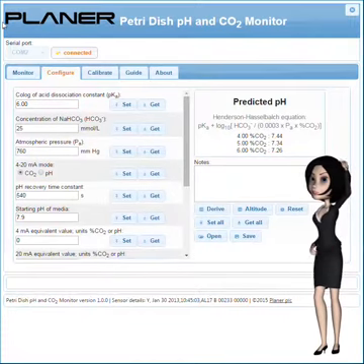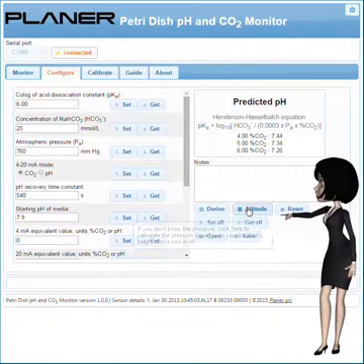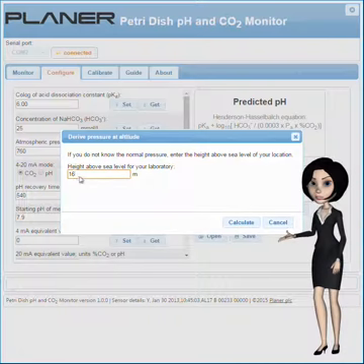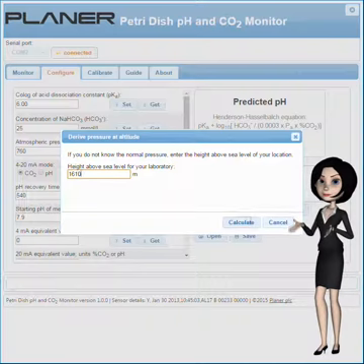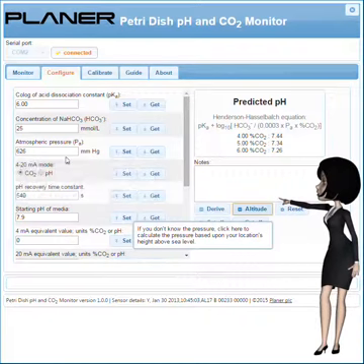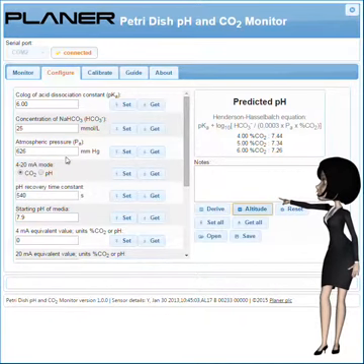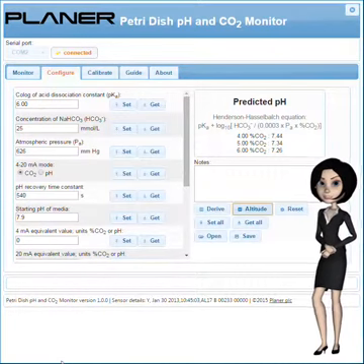But what about the pressure? No problem — use the Altitude button. My lab is up here in Denver, so I can enter my height above sea level: it's about 1600 meters. The pressure has dropped to around 630 millimeters Hg, which will affect the concentration of CO2 that I'll need to maintain a given pH.